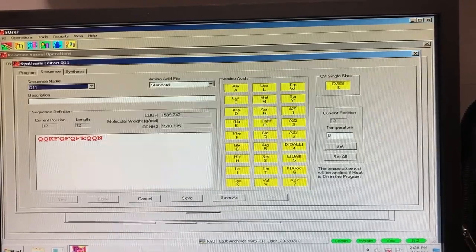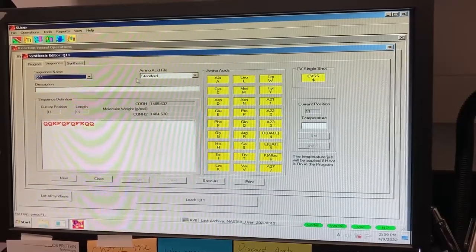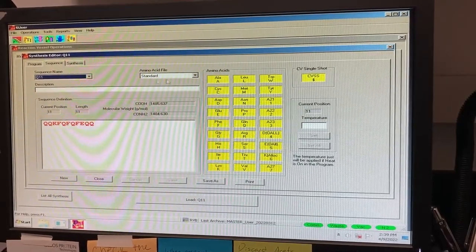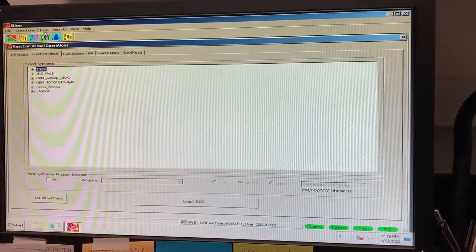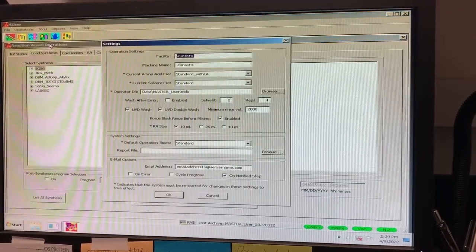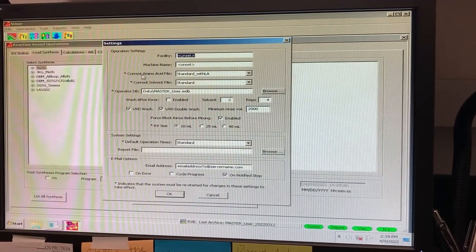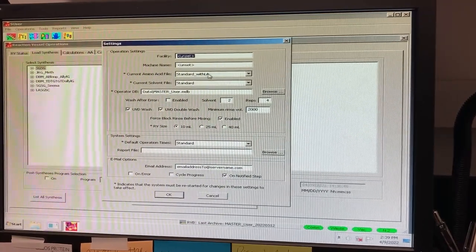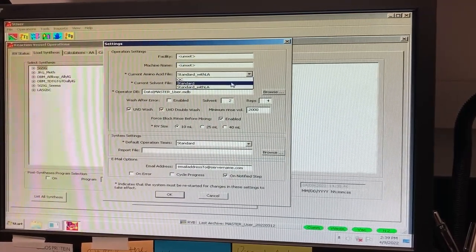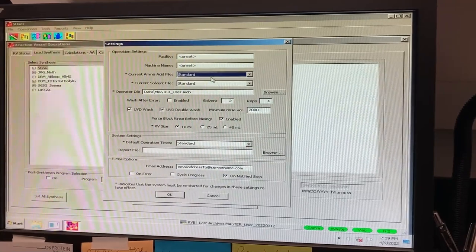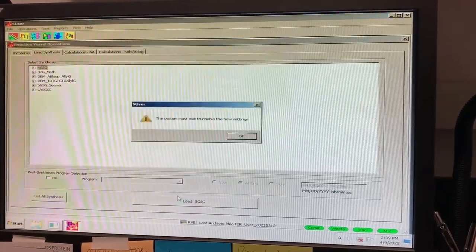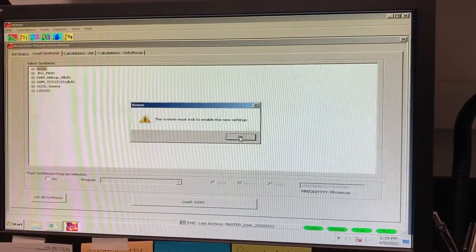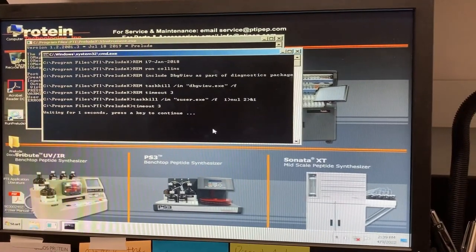Take note of the amino acid file listed to the right of the Sequence dropdown. The file the sequence is associated with needs to match the amino acid file under the Tool tab in Settings. If you need to change the amino acid file in Settings, you will need to close out of the program and reopen it. If the amino acid files do not match, your sequence will not appear when you load your synthesis.